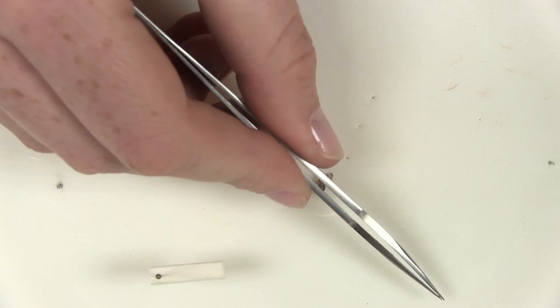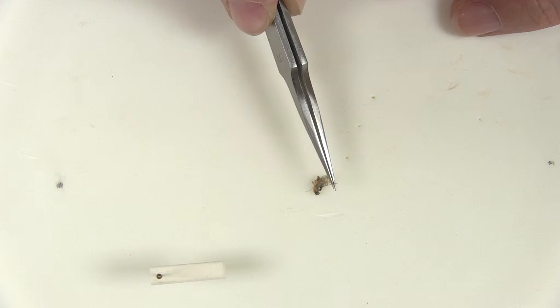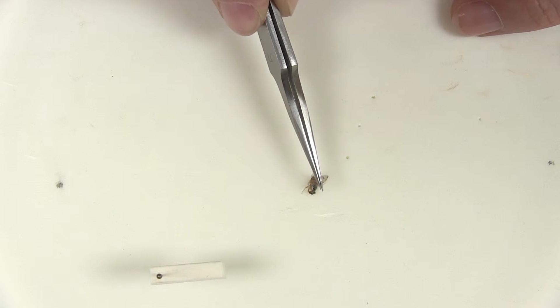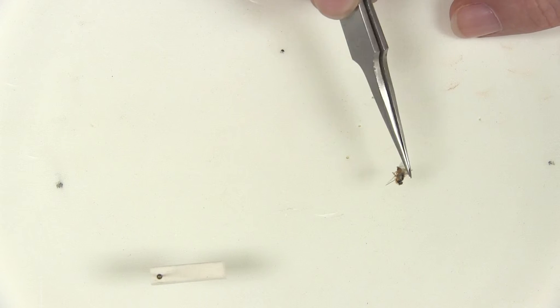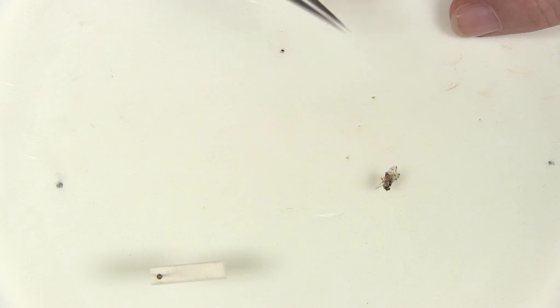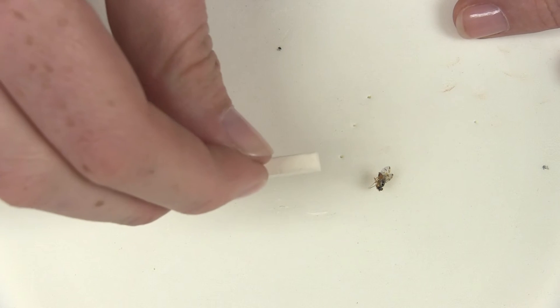Carefully insert the micro pin into the lateral side of the thorax of the fruit fly at a 45 degree angle, making sure not to pierce the legs or wings of the insect. The insect should be pinned three quarters of the way from the top of the micro pin.